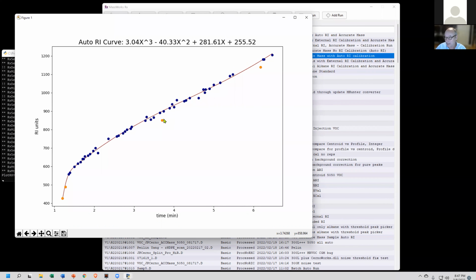Of course, it doesn't have retention index data, but it has the forward and reverse search, and it has the spectral accuracy. And what it can do is plot out only the highly confident matches. So it doesn't choose anything that has a poor match in terms of the spectral search. And if you plot them, you would expect, of course, retention index to have an ascending order. And we can fit that to a curve quite nicely.